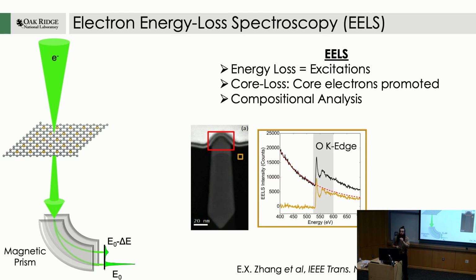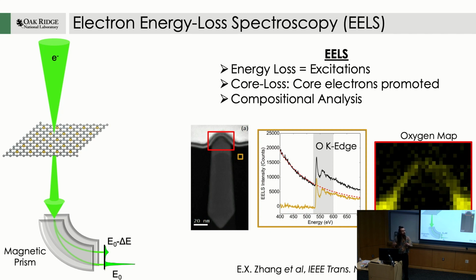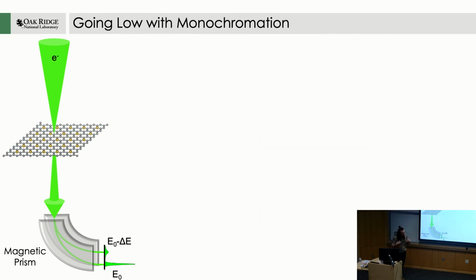Then we can go through each individual probe position, measure the intensity of our signal at 532 electron volts, and produce a direct map of the oxygen within the sample. This is the conventional way to do EELS, and it's really powerful, and there's tons of work that's been done on it. But that's not what we do. Well, it's not all we do at Oak Ridge anymore.